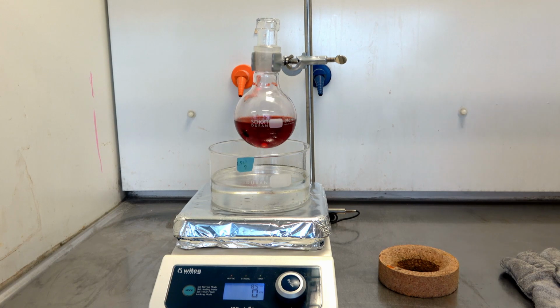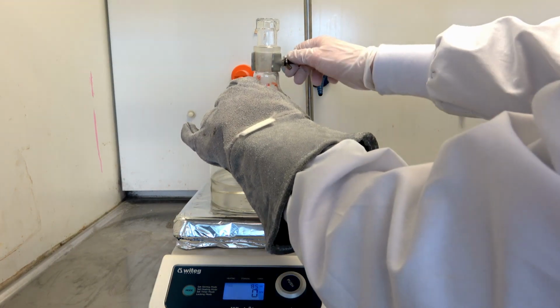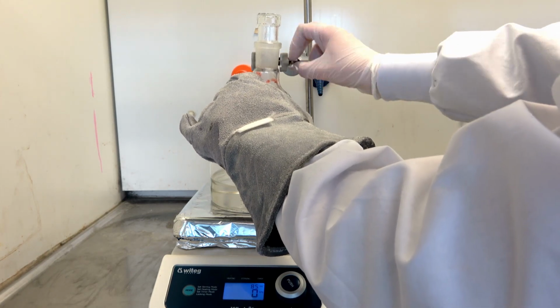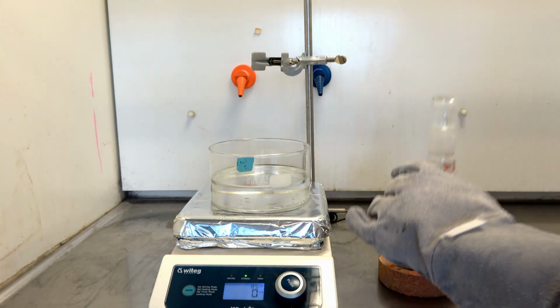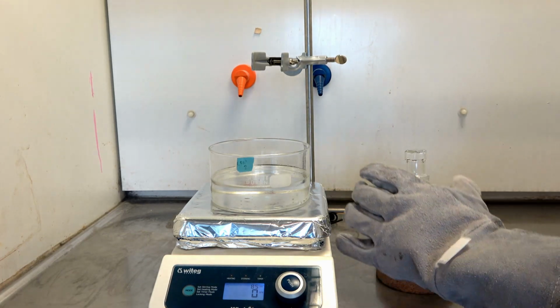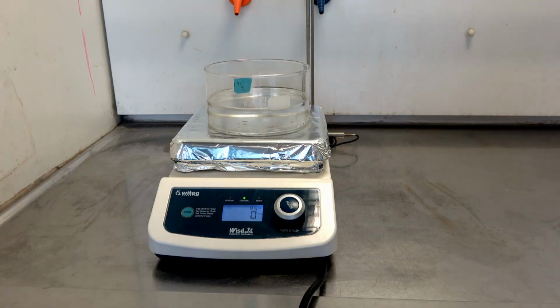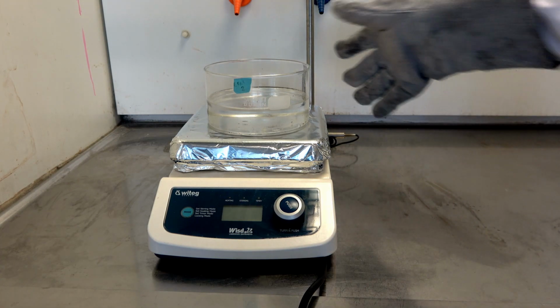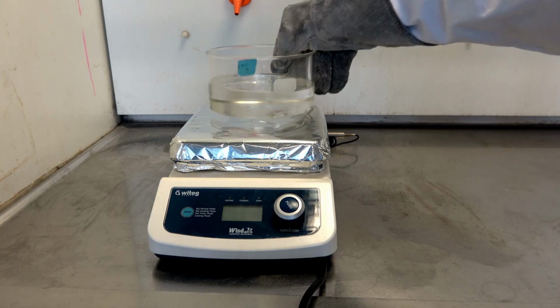Place the flask in a cork ring inside the ventilation hood and allow it to reach room temperature before taking any further steps. Finally, turn off the instrument. Once the oil bath has cooled down, it can be removed from the stirrer.